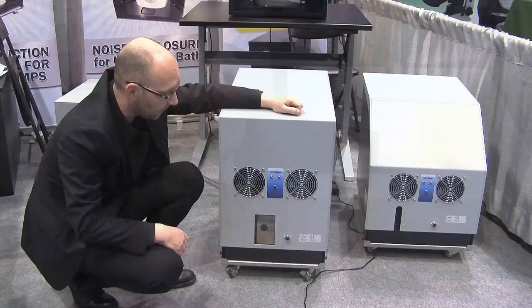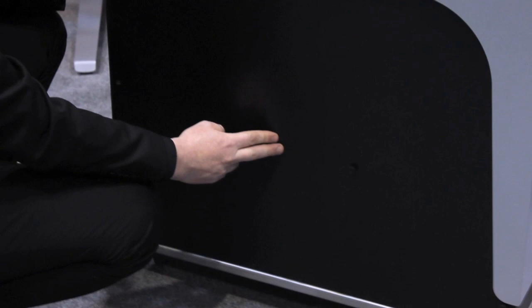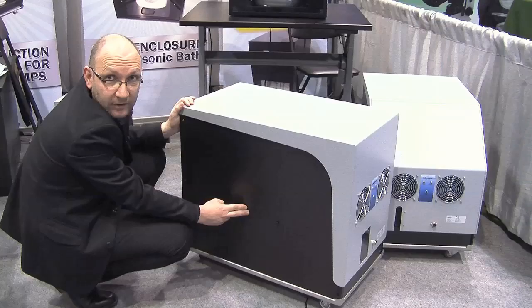On this enclosure you can see a window here, so you can check the oil level directly without removing the cover. There is also a trap here to access the ballast valve, for easy access — each week you have to ballast the pump.